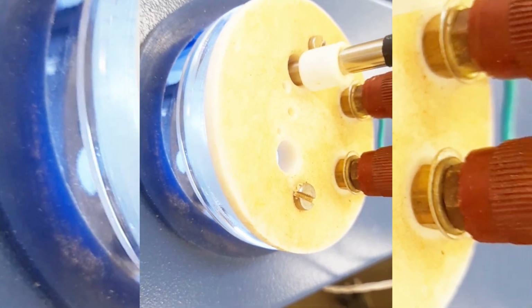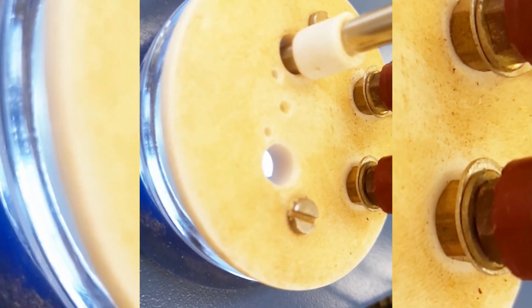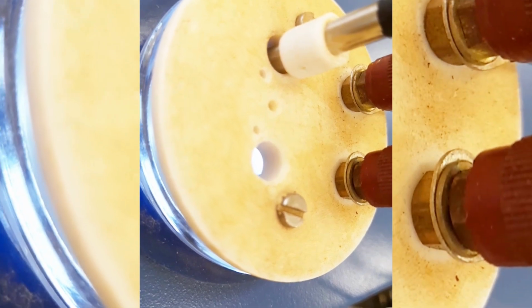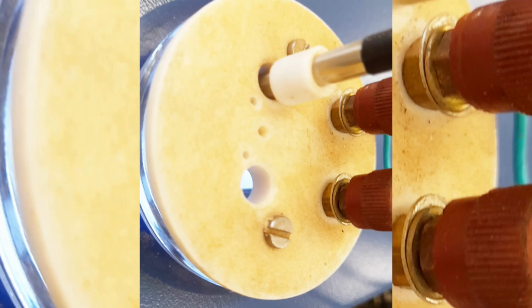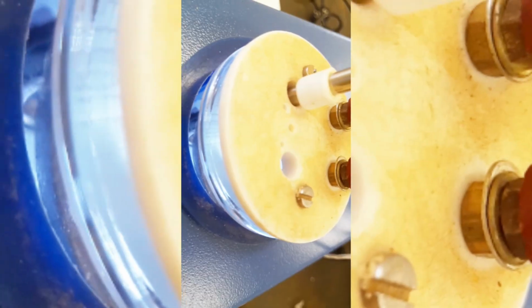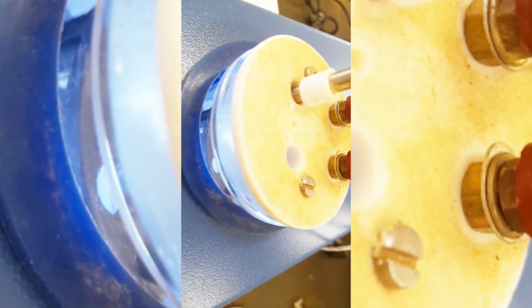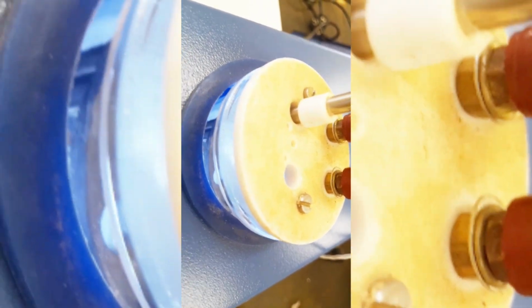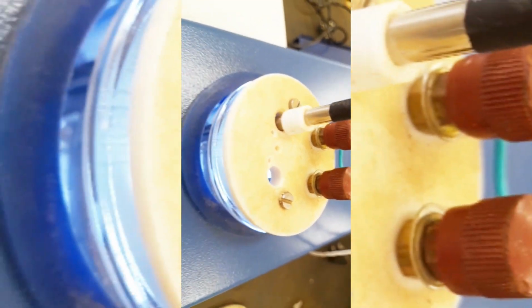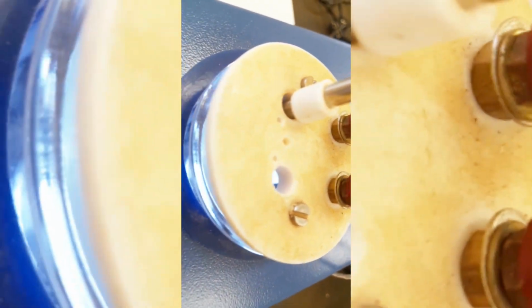Boiling points can also be measured with this instrument by taking glass tubes, where we keep the sample from one side of the tube, like how the sample is inserted for the solid. In the same way we can insert the liquid sample also, and keep it inside the big hole, so that the temperature at which the liquid starts forming bubbles is called the boiling point of the particular sample. So this is how we can measure the boiling point and also the melting point of organic compounds.